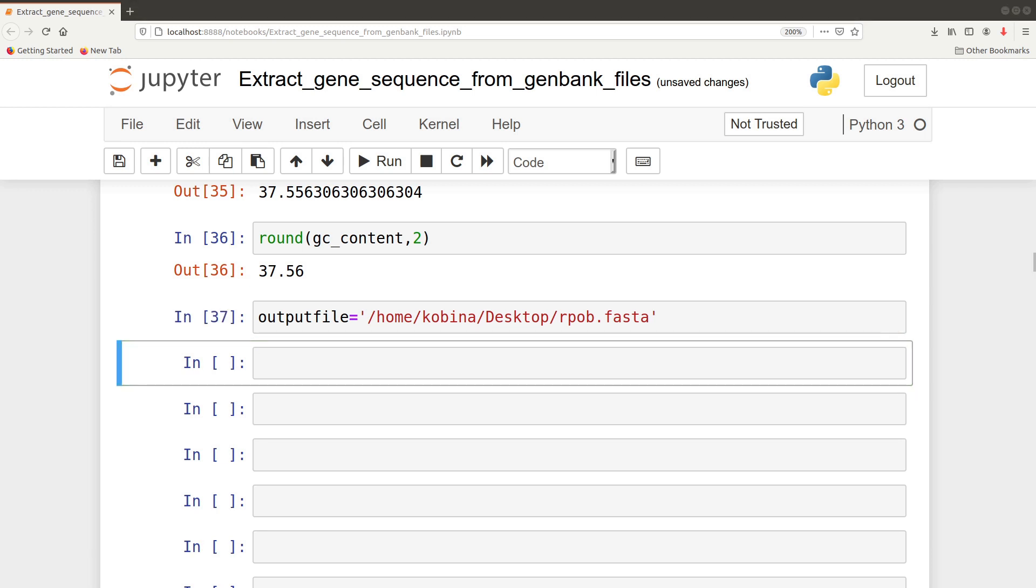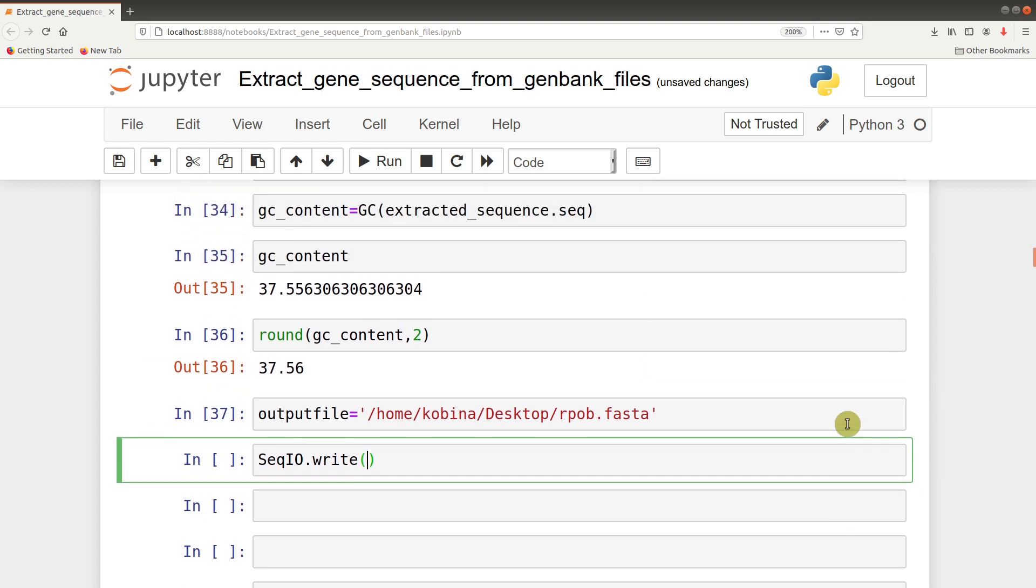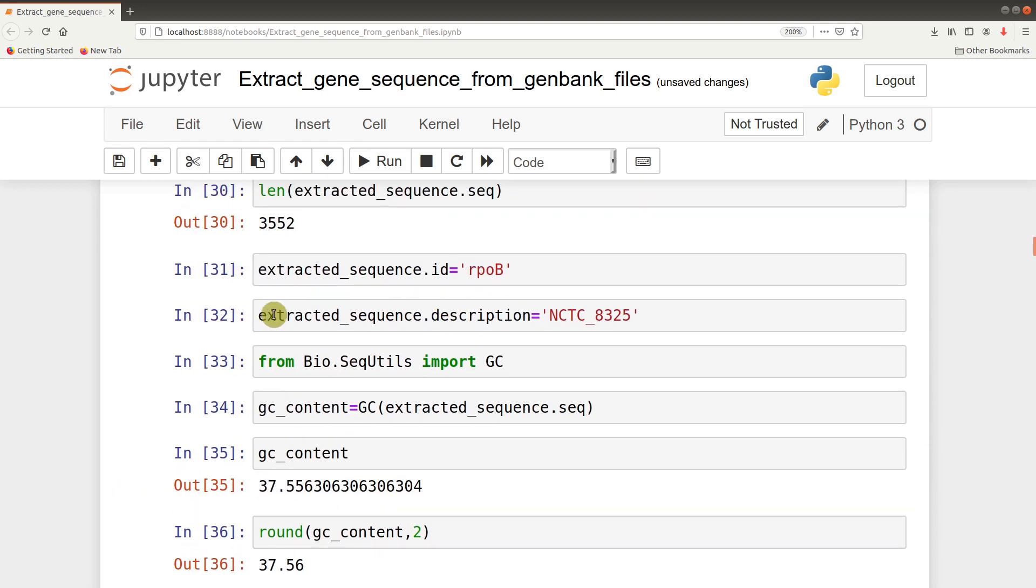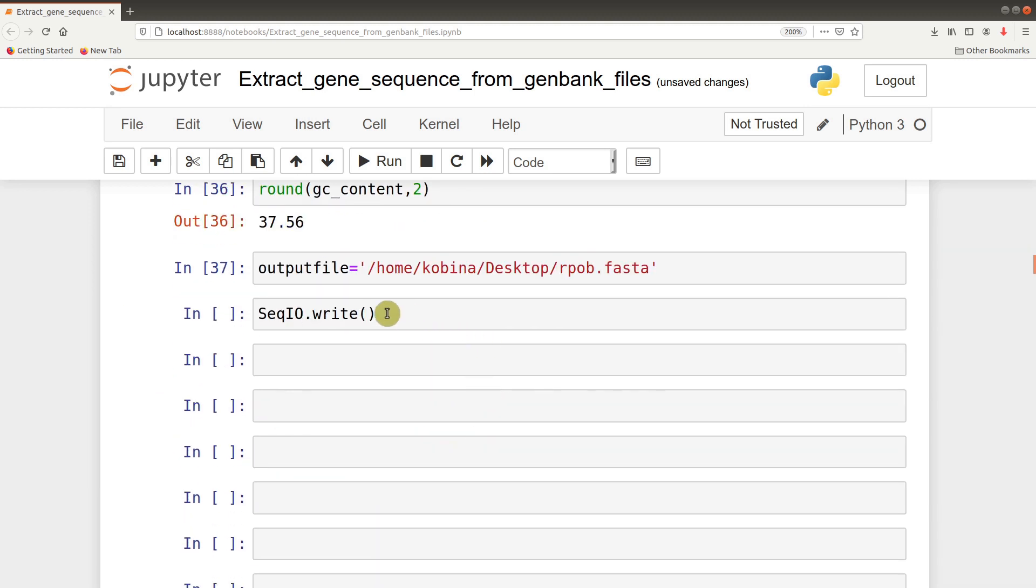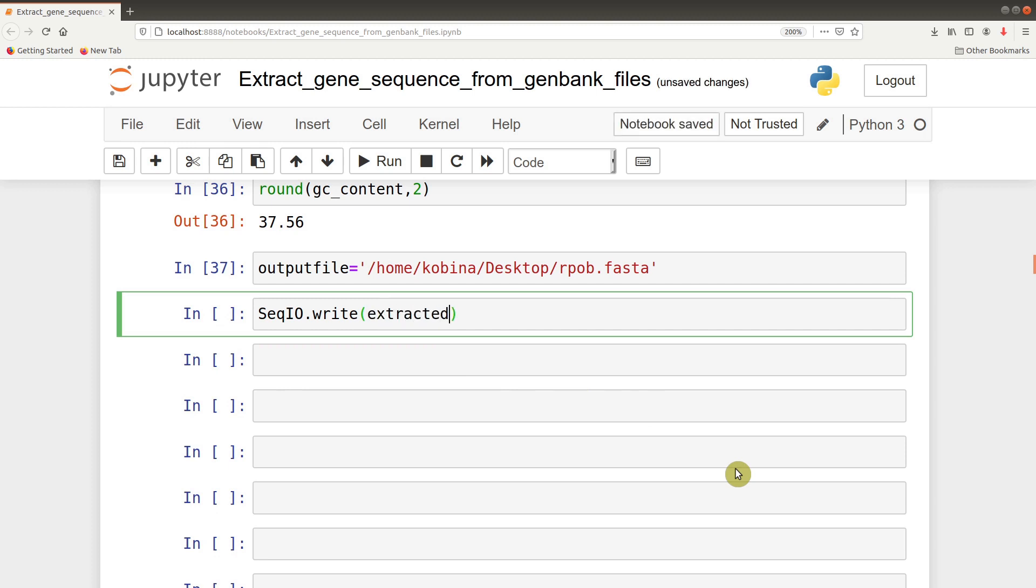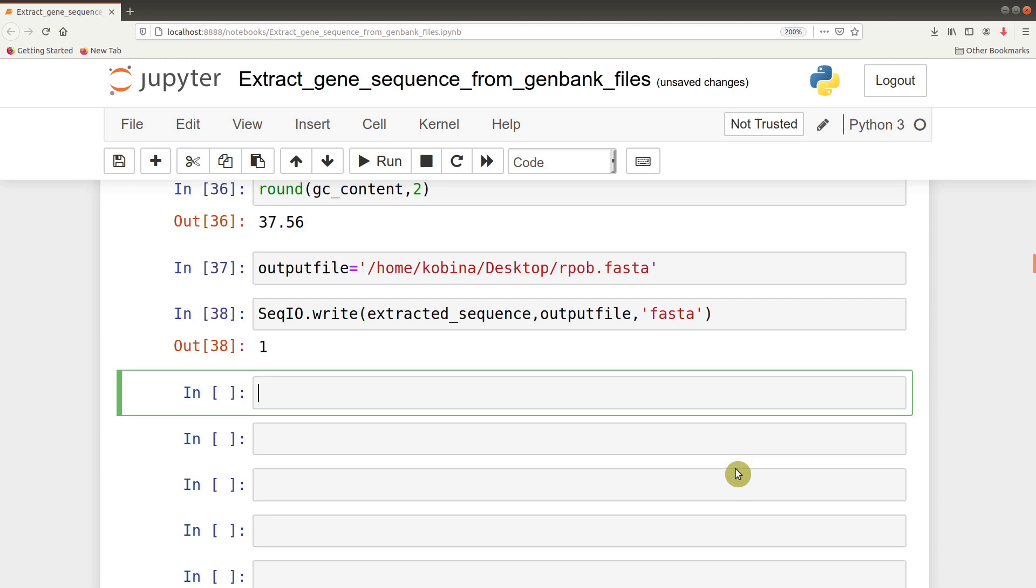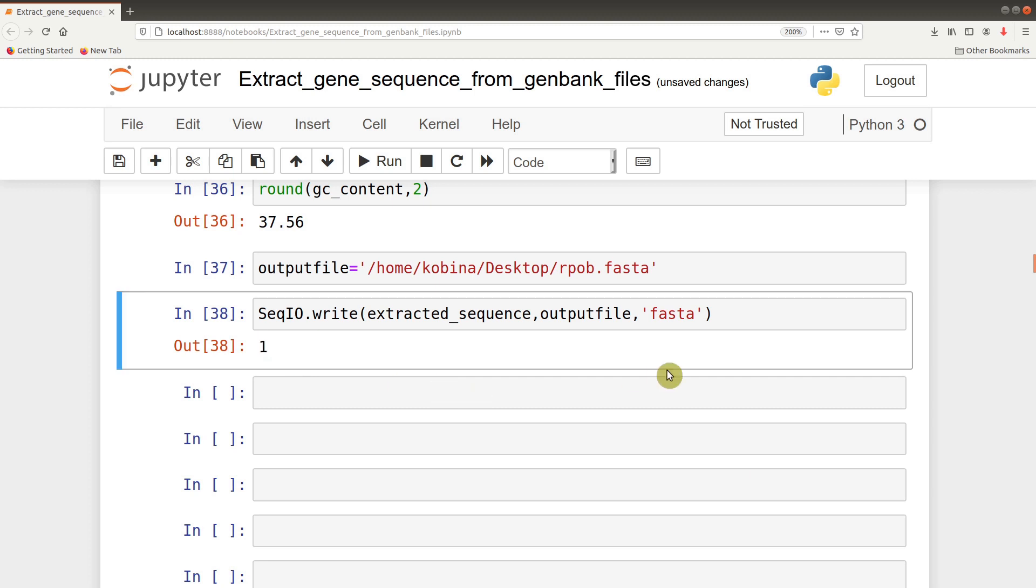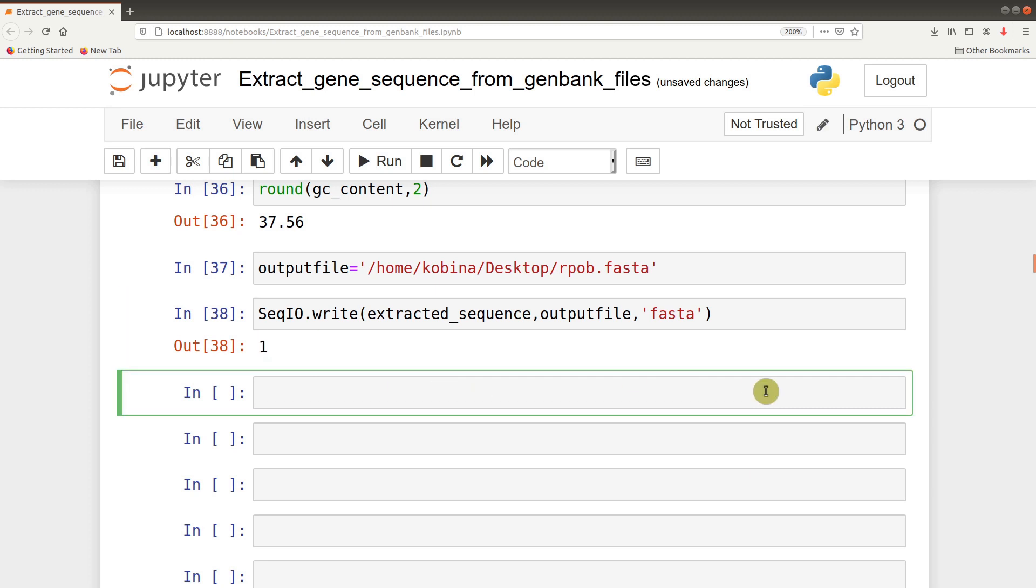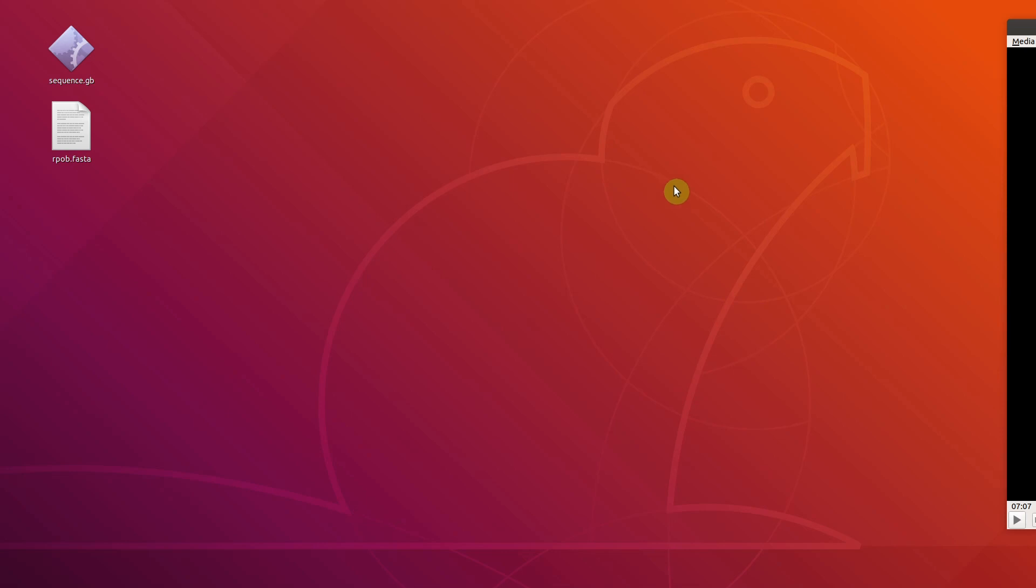After specifying the output file, we now save it finally. We say SeqIO.write. Here we give these details: the sequence object itself which is extracted_sequence, then we give the output_file, and finally the format which is fasta. Once we're satisfied, we now save it. It's indicated 1, which probably means one sequence has been saved. Now let's go to the desktop to check it. Yeah, so there it is.